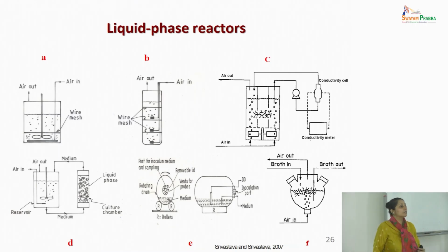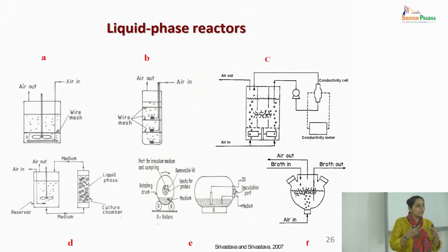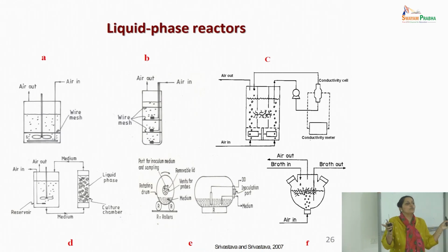Then people have also planned to divide. I was talking about the hyperhydricity problem with organ cultures or root cultures, which means a lot of water retention can lead to thicker boundary layers and therefore nutrient and mass transfer limitations. So how can you avoid that problem? You have to reduce the boundary layer phenomena, which means you do not allow water retention to happen on the roots. So people have, in liquid fermentations, divided the reactor into two chambers.